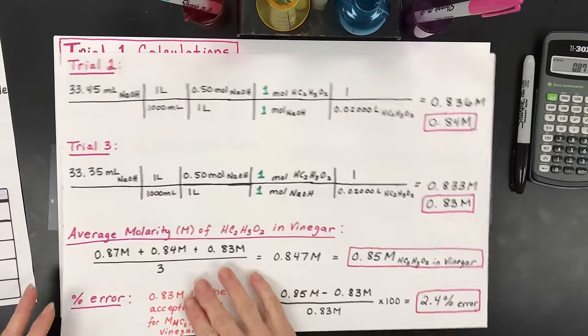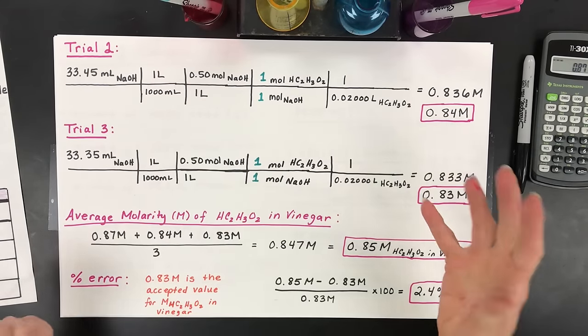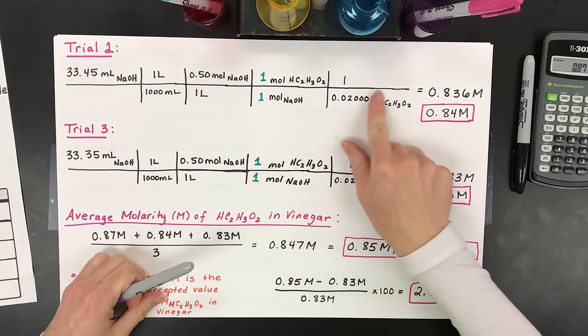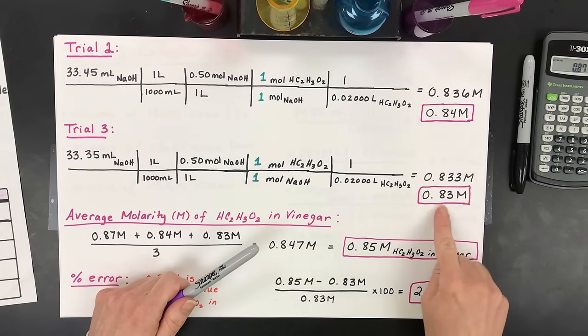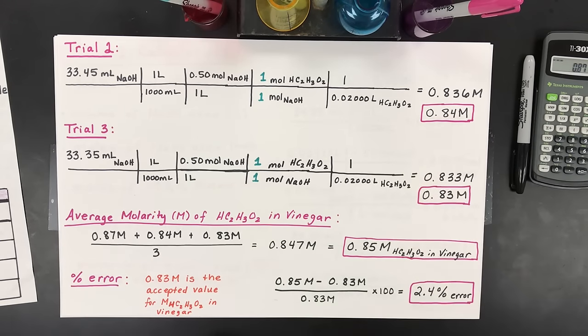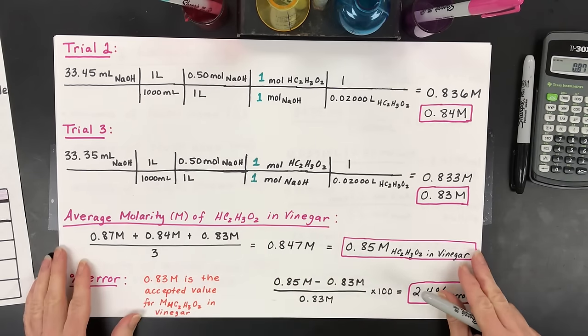So here's the work and answers for the next two trials. You can even line them all up. This time I didn't do step by step. I put it in a long stoichiometric or unit factor method setup. So I got 0.84 and 0.83 with trial 2 and 3. Then I'm gonna take an average molarity to get 0.85 as my average of all my trials.